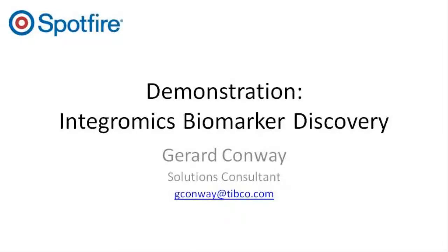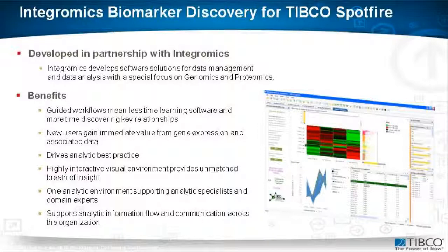Introducing Integromics Biomarker Discovery for TIBCO Spotfire, our latest offering in the area of microarray analysis. Integromics Biomarker Discovery, or IBD for short, provides guided workflows, which means less time learning software and more time discovering key relationships. Additionally, Spotfire's highly interactive visual environment allows for unmatched breadth of insight into your data.